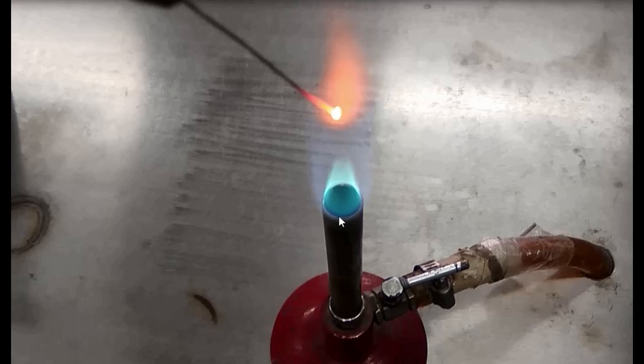This part is the non-illumination flame, whereas this one is the hottest region, and this one is the inner blue core.